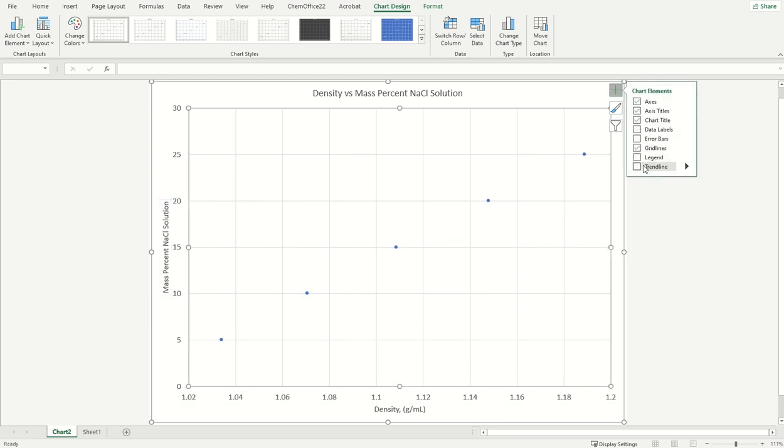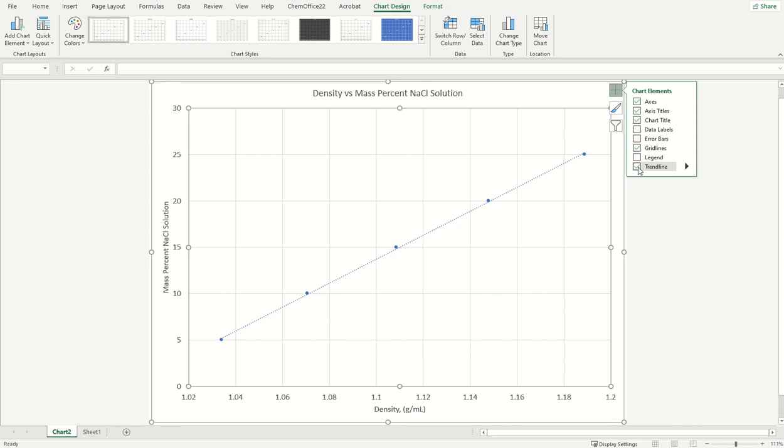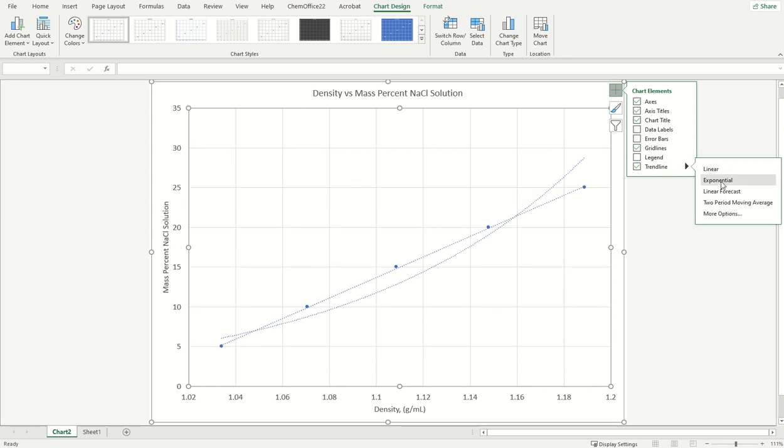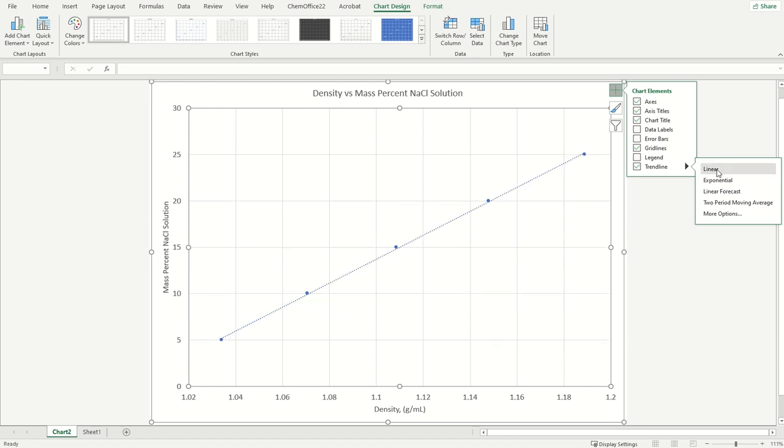So in the plus sign, we'll go to this button here, the trend line. And there's different options here. You can actually choose linear, exponential. You see it a little bit better, and it does not seem to fit as well. The linear fits better, which is what we expect.